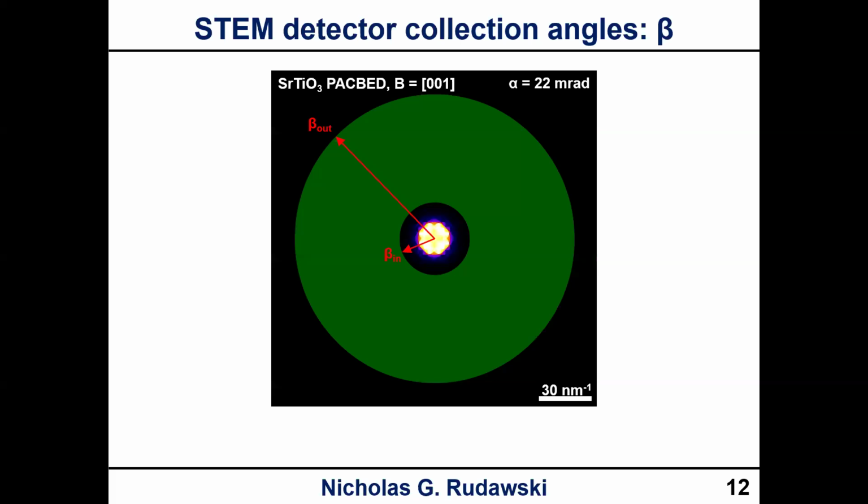Okay. So then we project a CBED pattern onto the detector, right? Because we can't change the size of the detector, but we can alter the size of the CBED pattern that's being projected onto the detector. So what we see here is that I'm not magnifying my pattern a whole lot, and as a result of that, my collection angles are actually quite large. Large, of course, being kind of a relative term in STEM. I think the inner angle here would be something around 50 millirad, which is really only about 3 degrees, but that's actually quite large in terms of STEM.